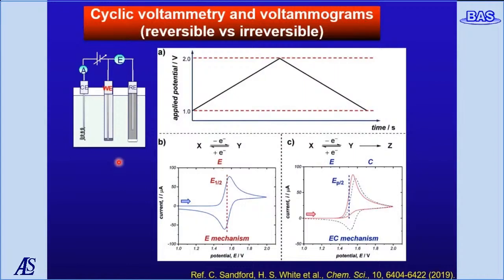First of all, I start with reviewing the last lectures, in particular cyclic voltammogram methodologies. Cyclic voltammetry is a non-steady state method to investigate reactions at the electrode surface.